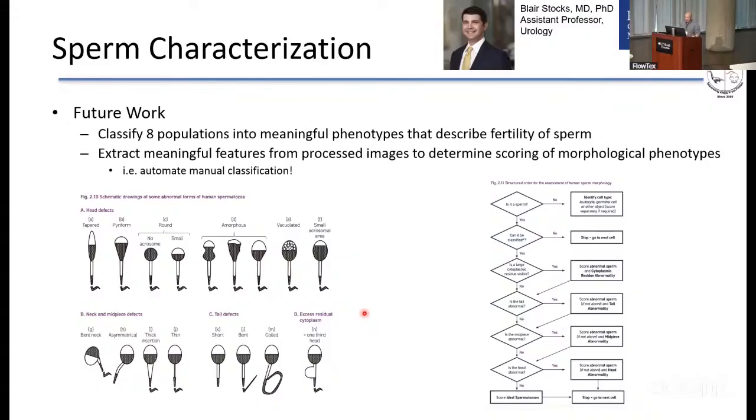So we have a lot of data to work with. We have about 2.8 million images per plate, and we ran multiple 96-well plates. So it's just having the time to do it. And we're hoping that with more images to classify, we will be more accurate in our classification versus the classical method.